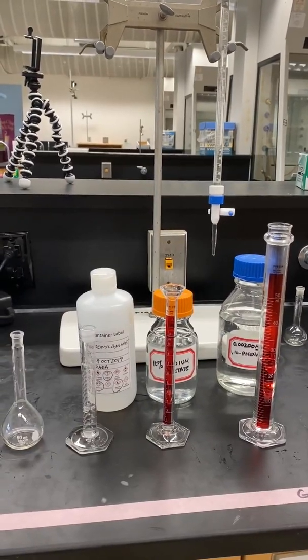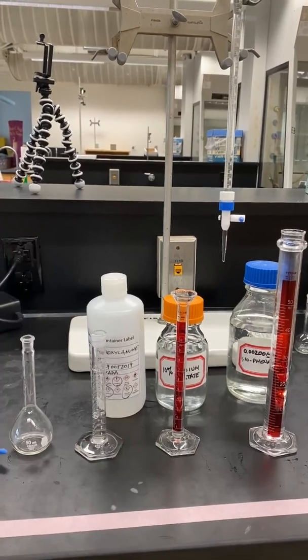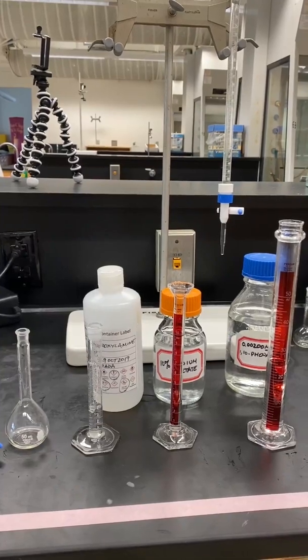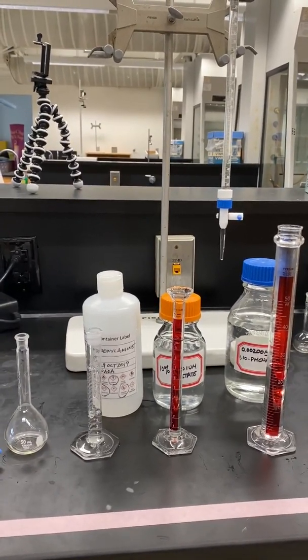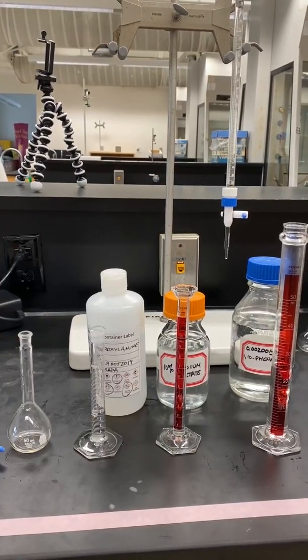Repeat the preceding steps to make solution B using 2 milliliters of the stock iron solution from the burette, followed by 5 milliliters of hydroxylamine, 10 milliliters of sodium acetate, 25 milliliters of 1,10-phenanthroline, and then filling to the mark with distilled water. Transfer this solution to test tube B.